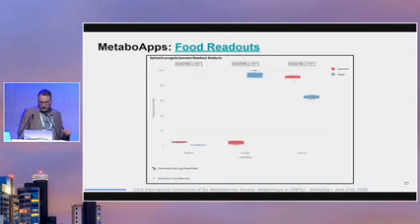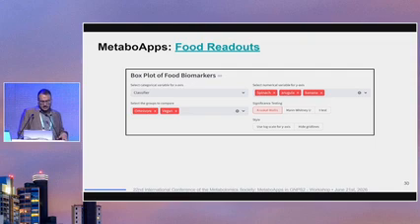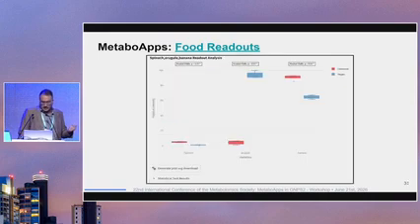And then you can also change some parameters. For this one, you can use log scale, for example, depending on how different it is, just to make it better to visualize. And then, as I mentioned, for all of those apps, since they have been developed in Streamlit, which is a Python framework for web development, you have the same feature for almost all of them.